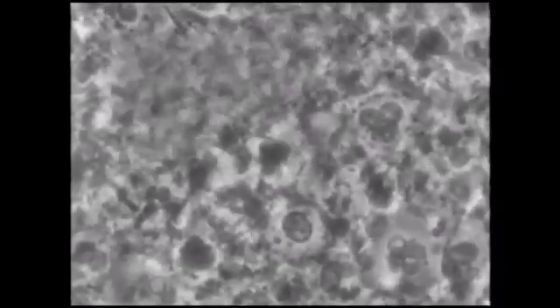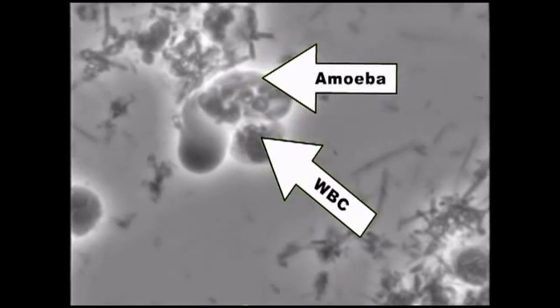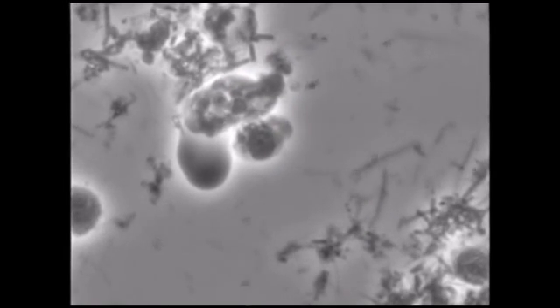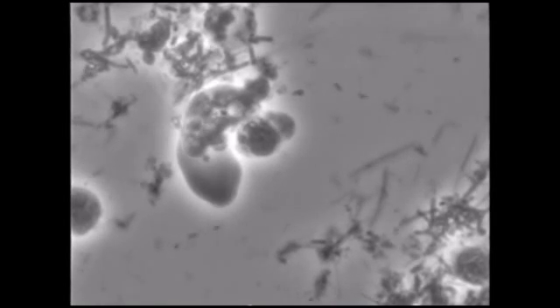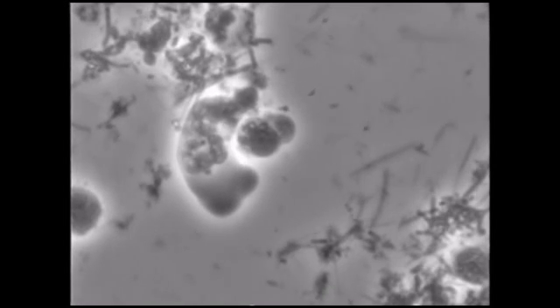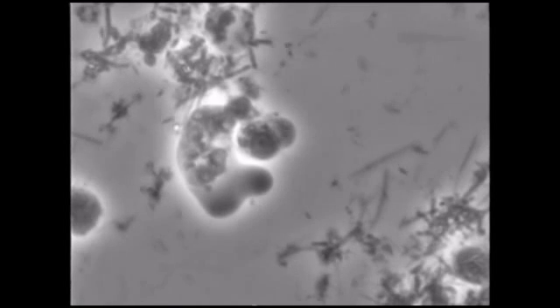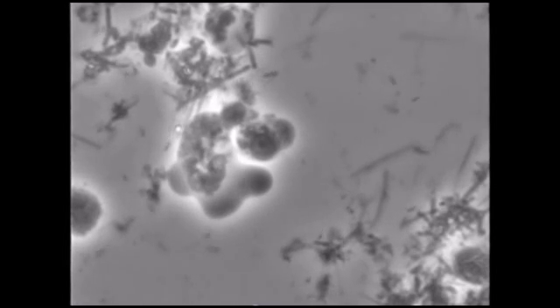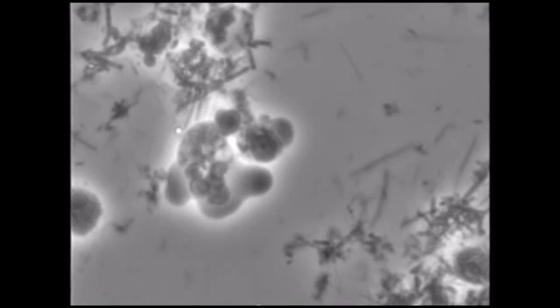Here is an amoeba that wraps itself around a white blood cell, then grabs onto it and drags it with him. The white blood cell is damaged by that attack and begins to expand in the middle, effervesce less, and the cytoplasm is almost entirely lost. In the smear, also note the small gliding rods and spinning rods. They too are associated with inflammation and bone loss.